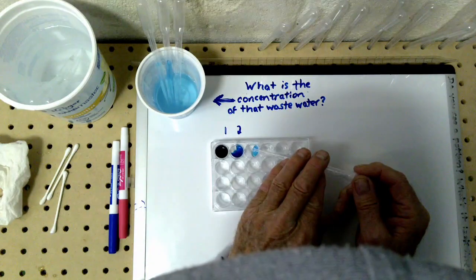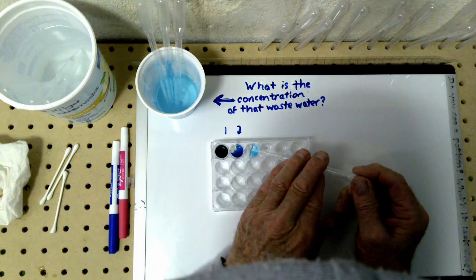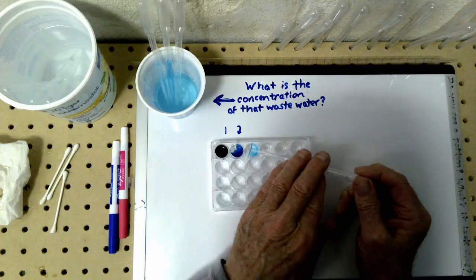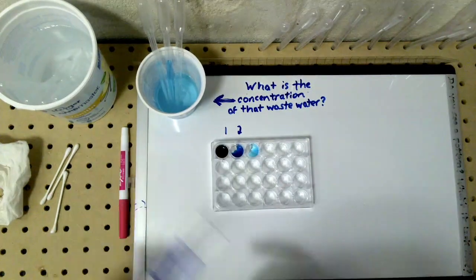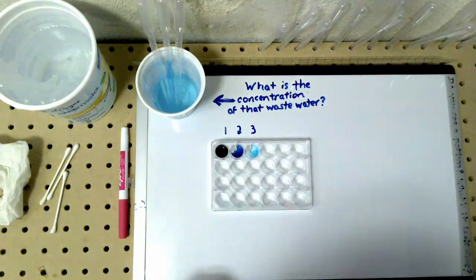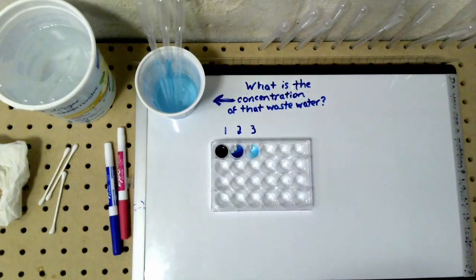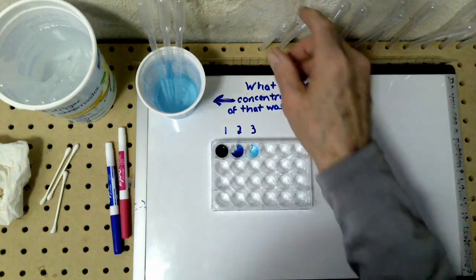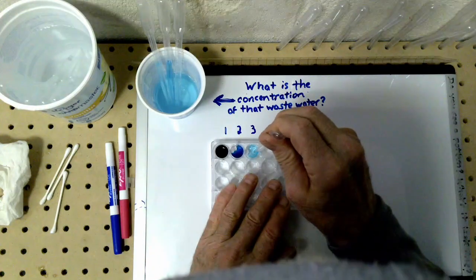1, 2, 3, 4, 5, 6, 7, 8, 9. Clean water, and put that back. So there's 10 to the 3 power, 1,000. Diluted so that the particles are 1,000 times further apart. We have to take another pipette here. Make sure that's all well mixed up.